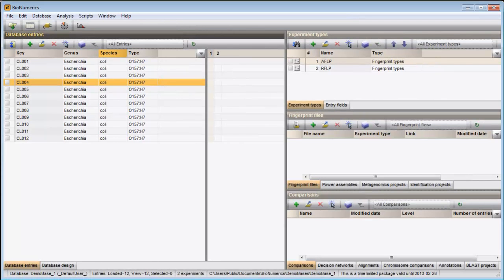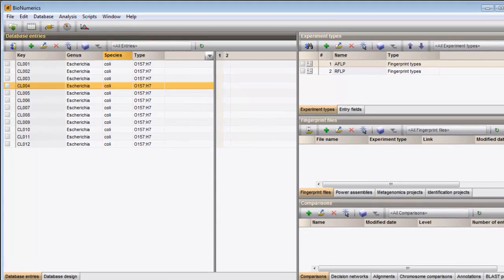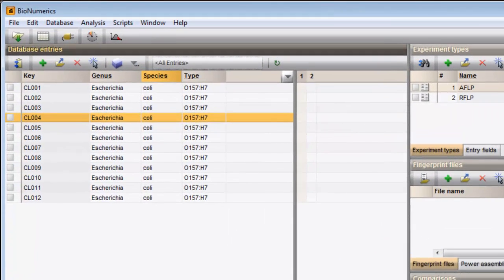In this video I will demonstrate how database information can be added to the Database Entries panel. This panel is located on the left-hand side in the main window.